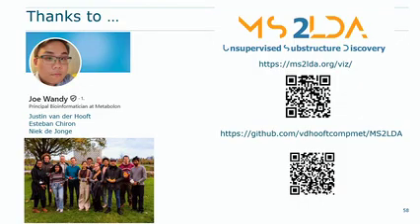Otherwise, just come to the poster if you're interested, and talk to us. Maybe another thing to mention, because if it wasn't clear yet, who knows what MassQL is? All right, so that is about a fifth of you. MassQL is a mass spectral query language that you can use to search for patterns in the mass spec data. There was a paper that came out a few months ago that you can check for all the details. But what we did is that we changed that language a little bit so it can work with the motifs. It was some effort, but now it's working.